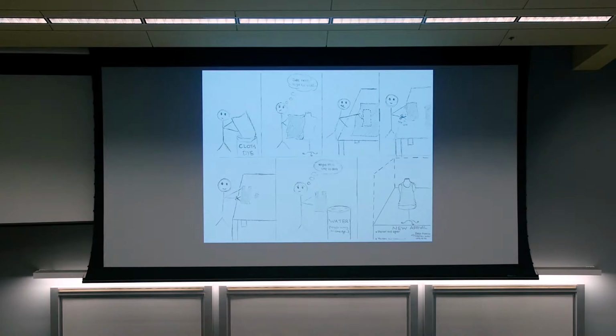So we thought overall that this picture was really good and clear when showing this process, but there were a few concepts that they left out. One of the concepts is the idea of using a clean room. When working with nanoparticles, we didn't use nanoparticles in this experiment, but when you work this small, you need to make sure that nothing gets into the design and messes it up.